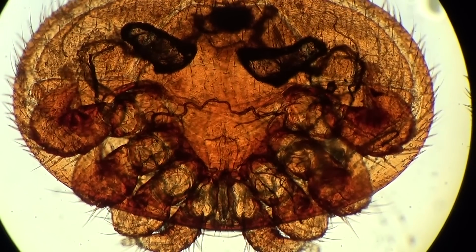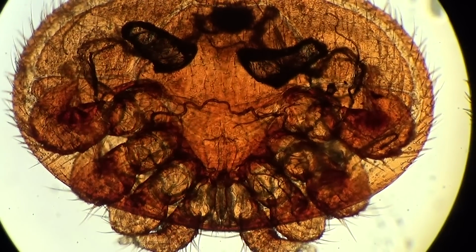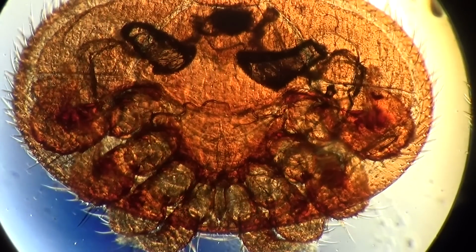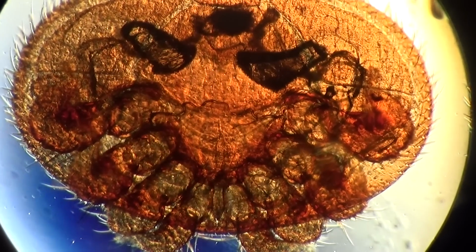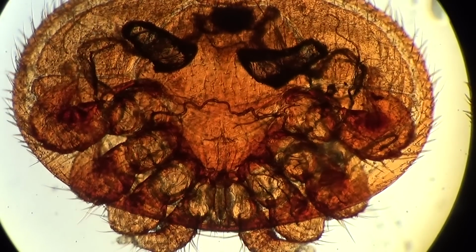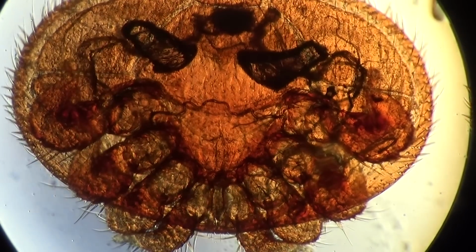Of course, this is a very dangerous infestation, because mites make wounds on the body of the larva, pupa or adult of the honeybee. A female mite lives during the summer up to 2-3 months, and if it's overwintering, the female lives up to 6-8 months. And feeding, as I said, on the hemolymph of honeybees.